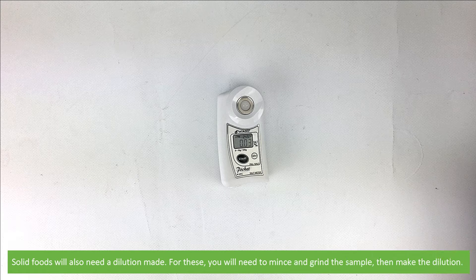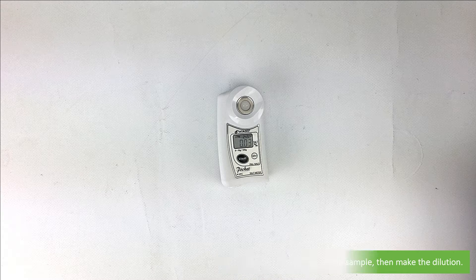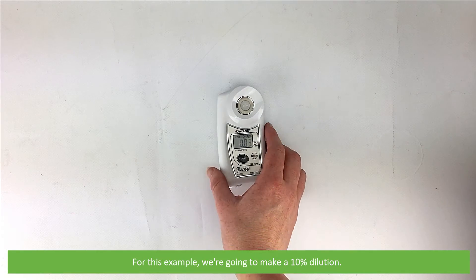Solid foods will need to have a dilution made too. For these, you'll need to mince and grind the sample, then make the dilution. For this example, we're going to make a 10% dilution.